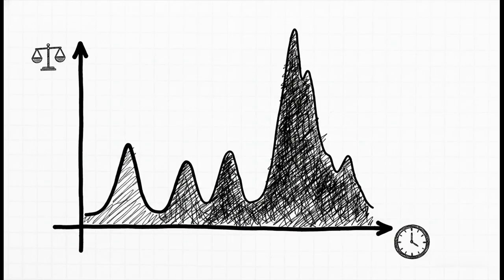That answers the qualitative question, what is the identity of this substance? But the y-axis, or actually more accurately, the total area under that peak, represents the concentration. That answers the quantitative question, how much of this substance is actually in the sample. A massive peak area means a high concentration of that specific molecule was present in our original mixture.